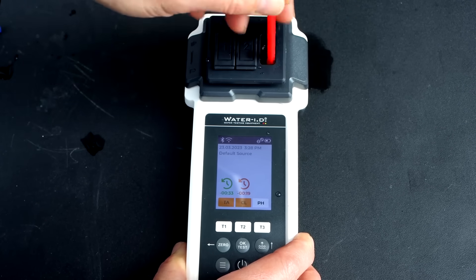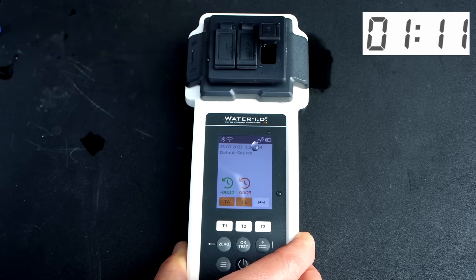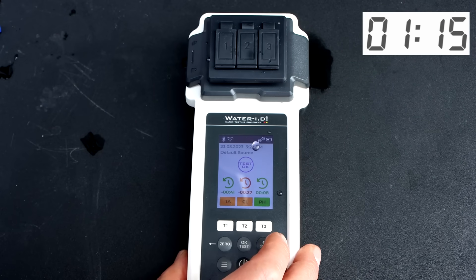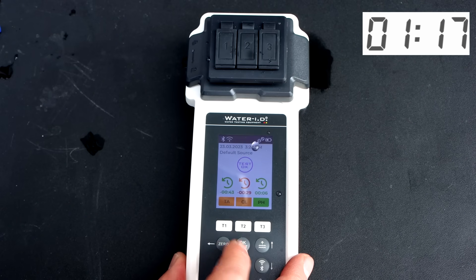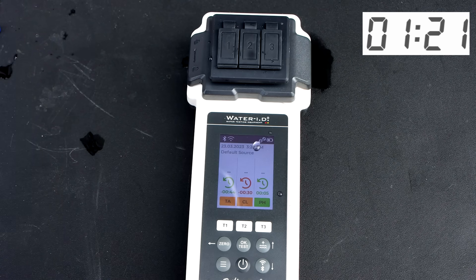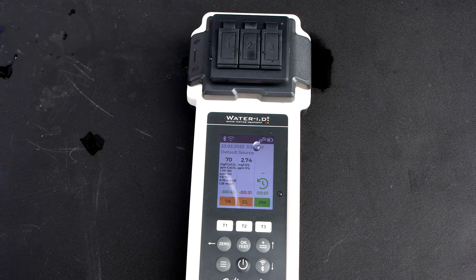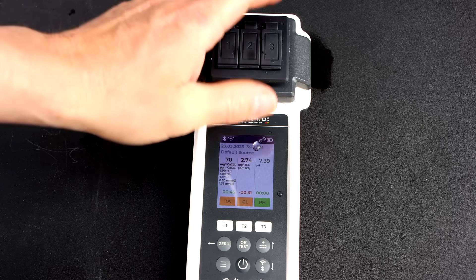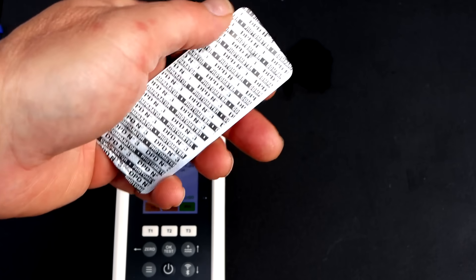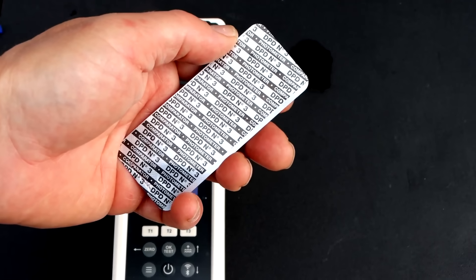The reason the chlorine came out with a red countdown is there's an ideal time limit to run each test, and I was a little bit off with the chlorine. But I've done multiple tests with this unit and I don't think the countdown is super critical in most test factors. The total alkalinity is 70, the chlorine is 2.7, and the pH is 7.39 — or 7.4.